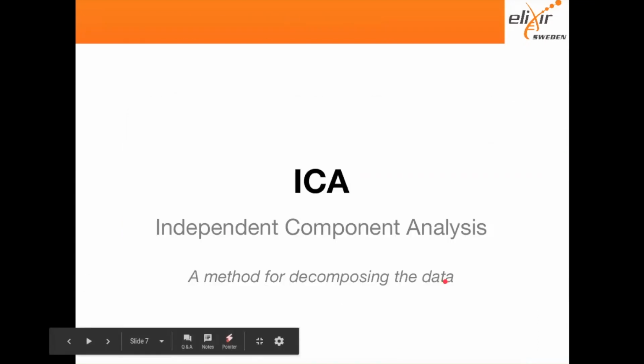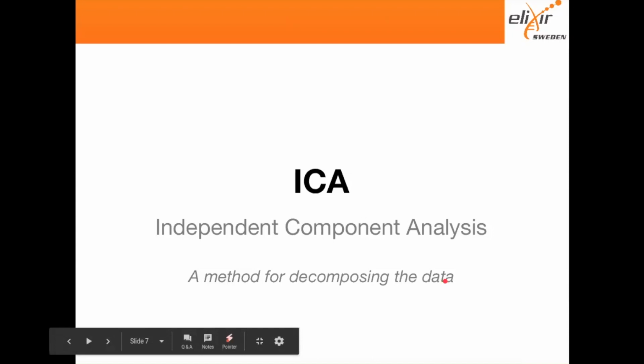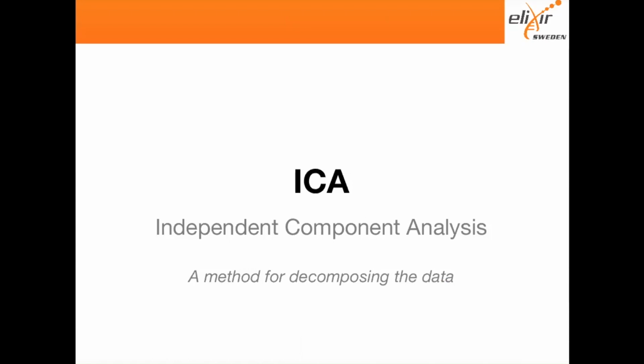Just before going a little bit into how to build the tree, how to set the trajectories, I just want to mention two other additional dimensionality reduction methods that are quite common. Monocle 1 uses ICA, and that is quite cited in the literature still. ICA stands for independent component analysis. It's quite similar to what we have in PCA, but the idea of ICA is to decompose your data rather than aligning them to the highest component that has the highest variance. You want to decompose to the sources of variation of your data.